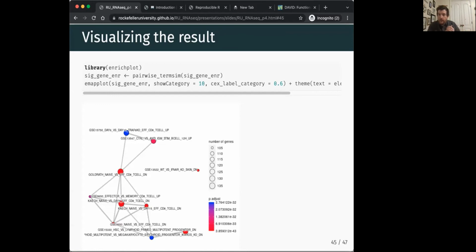Ties are not going to make too much difference in a GSEA unless you have a lot of ties, okay? Sometimes your data can stratify for some reason and you get a lot of ties, but generally it won't. If you have a lot of this stratification, then there's probably something up with your data, and you might need to do an alternate approach.